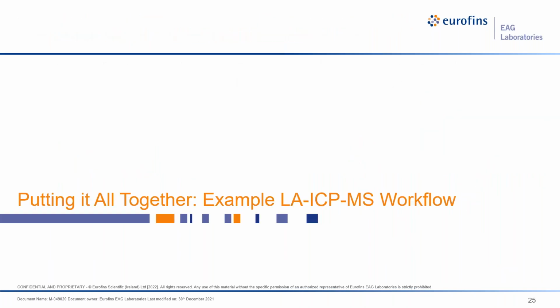So as I mentioned before, I skipped almost everything that happened in between the premise of that case study and the outcome. So for our final section, I want to return to case study 3 and put it all together in a project workflow, from sample prep all the way through to data processing and statistical analysis.